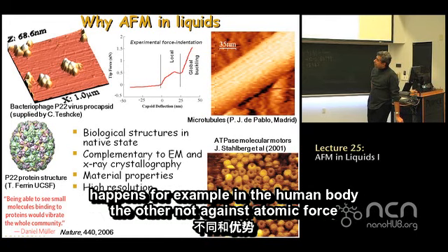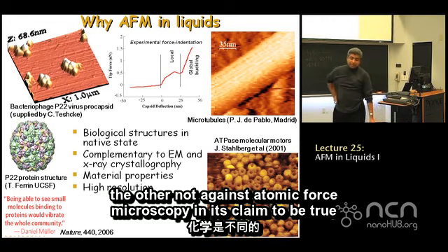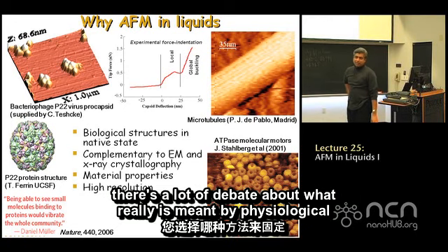The other knock against atomic force microscopy in its claim to be true native state physiological conditions is there's a lot of debate about what really is meant by physiological conditions.